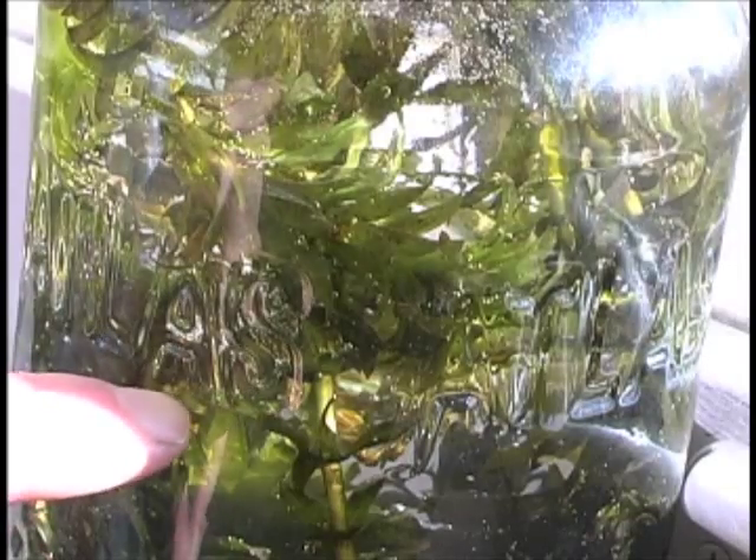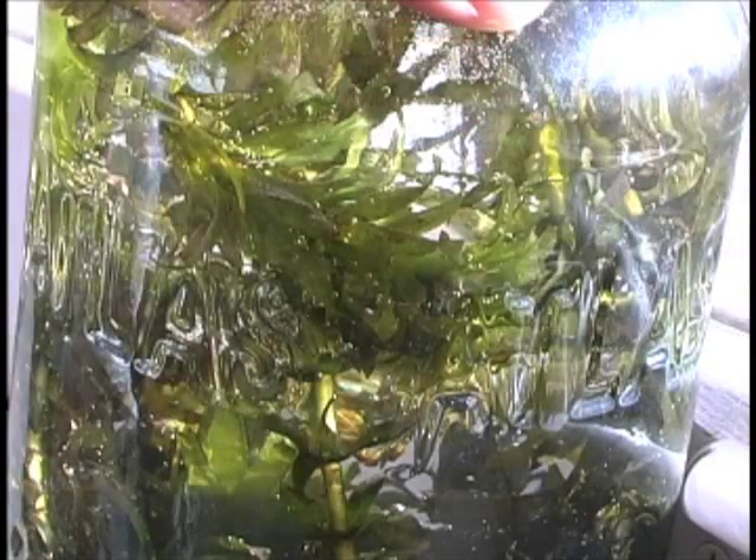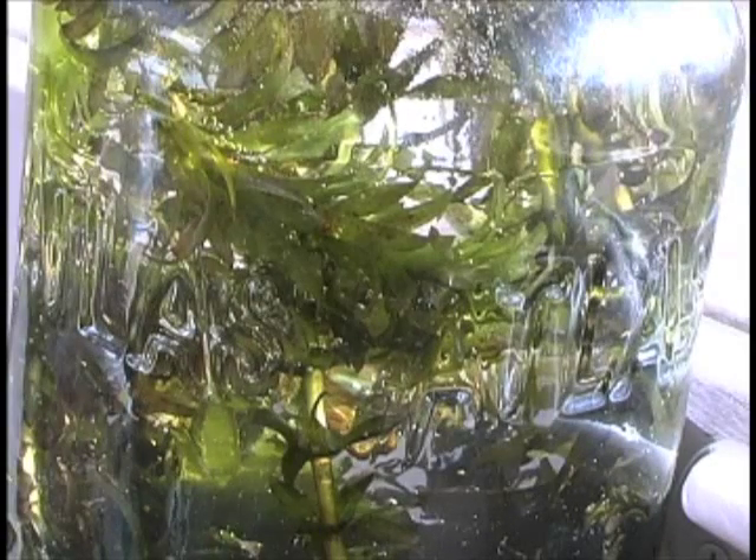Hopefully, you can see small bubbles forming on the leaves of the Elodea plant. You know your plant is photosynthesizing if you give the jar a little shake and you see lots of bubbles going up to the top.